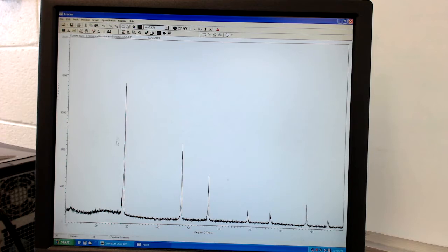What we want to do is find where all these peaks are. You can see the peaks here, right? We want to try to identify those peaks, the location, and more information about them. So we can go to Peak, up here in the top left, and hit Search, or Control P. You might have noticed that these little diamond shapes appear. There are searching parameters that you can change back up here to be more or less sensitive and pick up the various peaks.